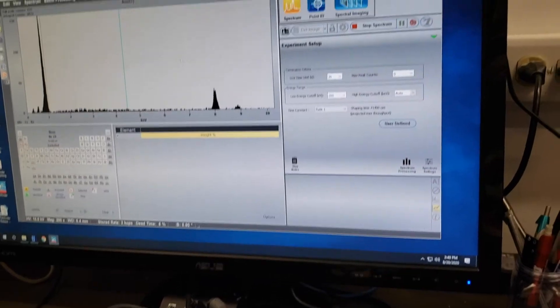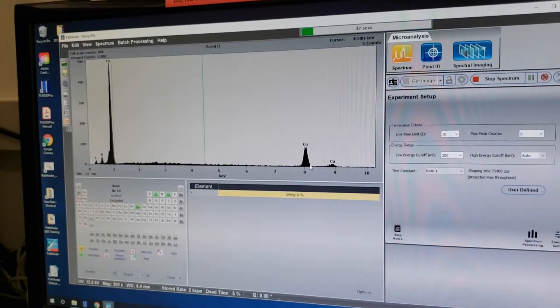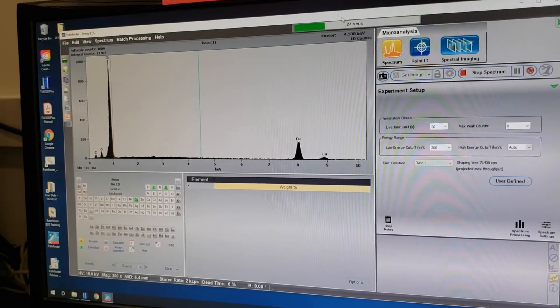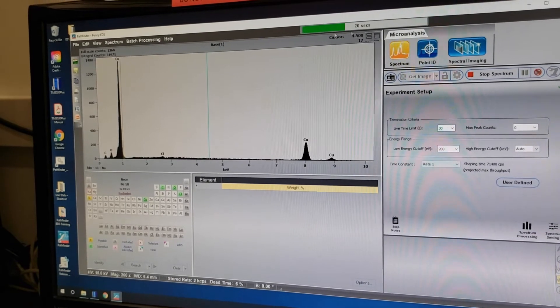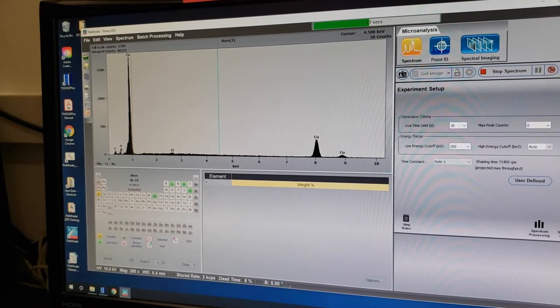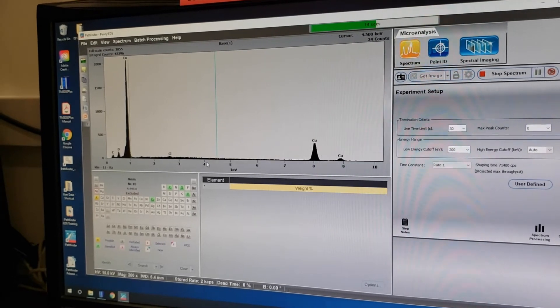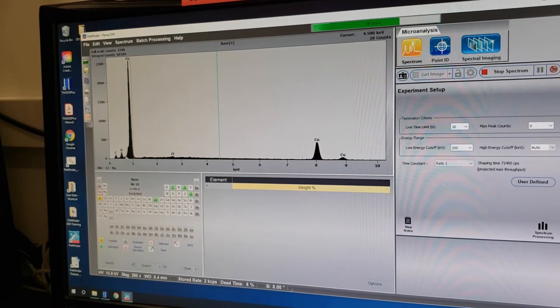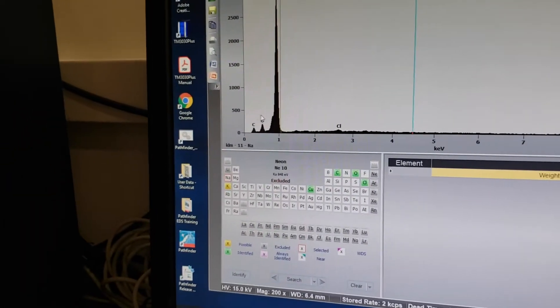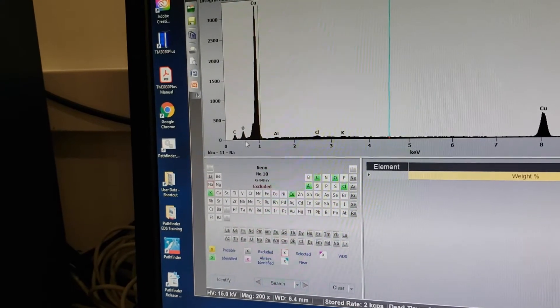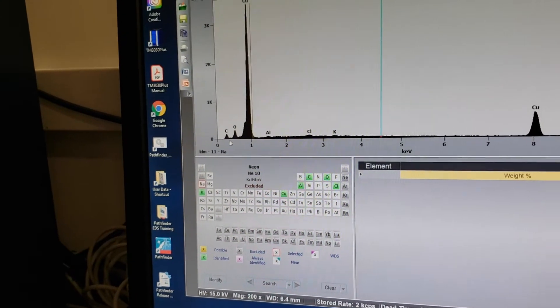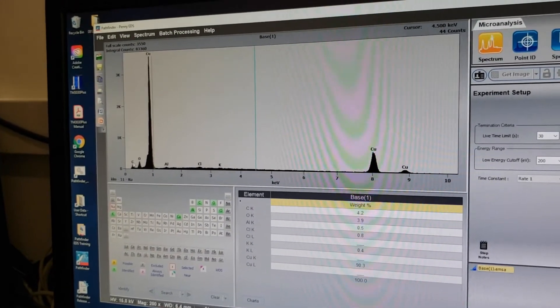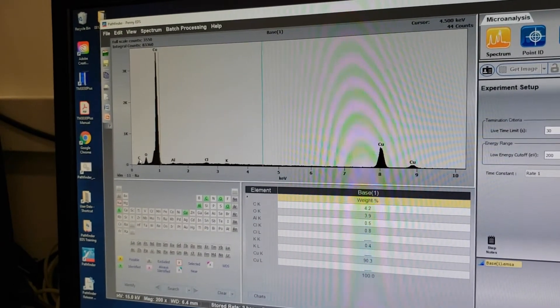I'm going to click Close and it's going to go into collection mode, collecting for approximately 30 seconds. It's going to auto-identify as many elements as it can. Not surprisingly, there's copper on our penny, as well as carbon and oxygen — probably a little rust or oxide on the surface. Carbon is basically everywhere, likely from touching it or dust falling on it.